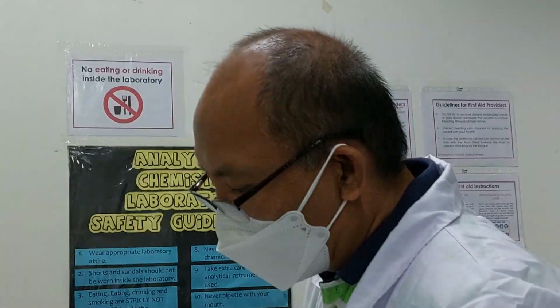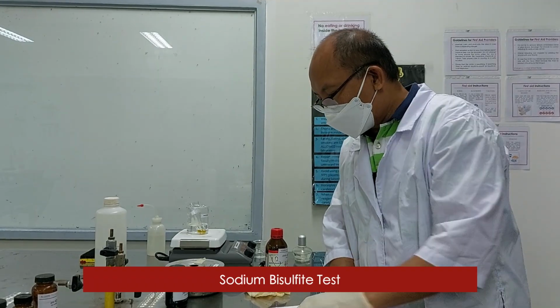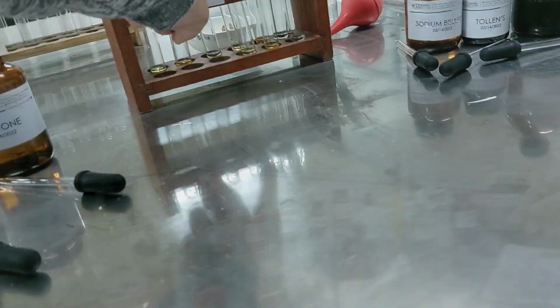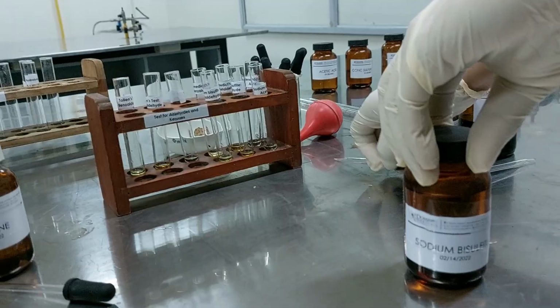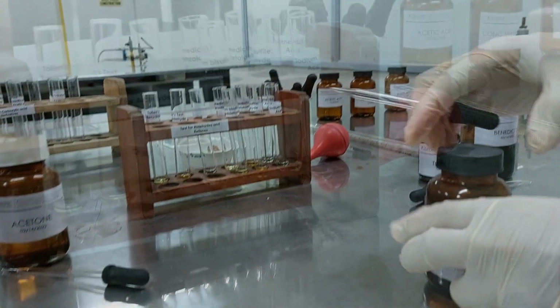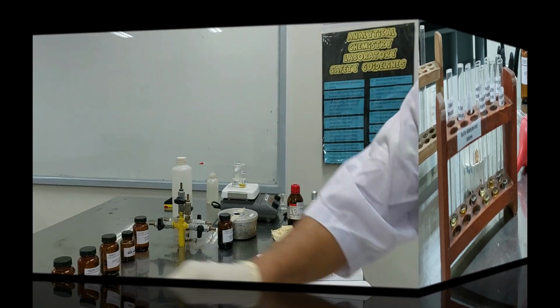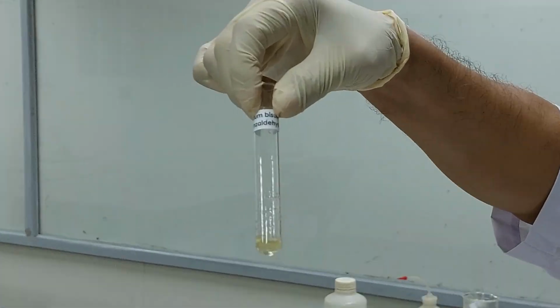The next test is your sodium bisulfite. So we expect a white precipitate here. You have to check the reaction. This is our bisulfite test, this is our sodium bisulfite. Let's see what will be the reaction for the 3 aldehydes and 1 ketone, acetone. So shake. We're expecting white. You see? We already have the solid form.